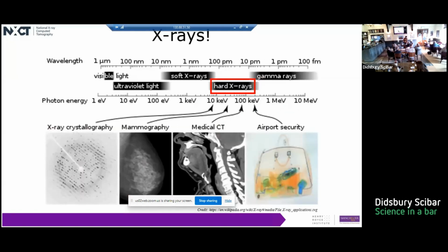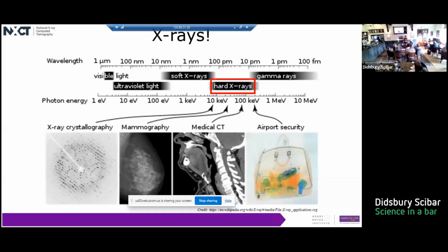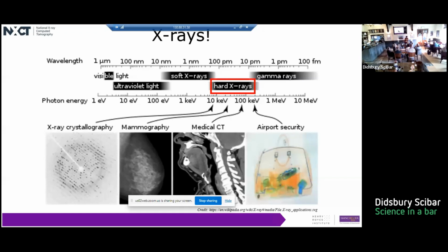So the story of X-ray tomography is a story of two things. The first one is obviously X-rays. We're dealing with the X-rays that sit within the hard X-ray zone. That's the sort of X-rays that get used for medical purposes and airport scanners, and as they get more and more energetic, you then move into the gamma ray part of the electromagnetic spectrum, but we'll leave that for now. Of course, X-rays are ionizing radiation. They can cause damage to human tissue. So when it is used in a medical context, it is used sparingly. You're only given a CAT scan if that is a diagnostic technique that will reveal something about your condition. They don't go around giving it out willy-nilly.